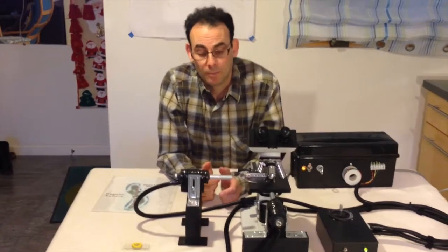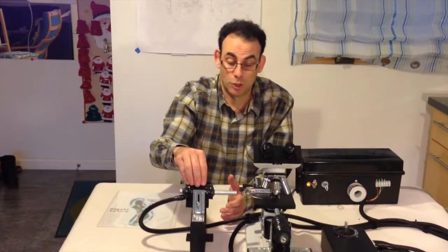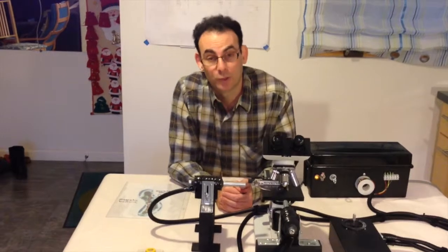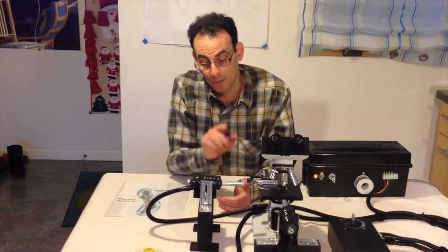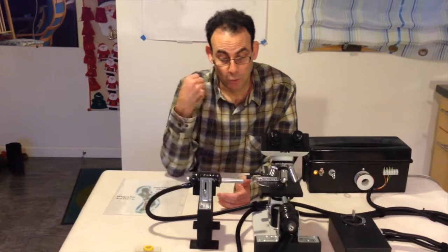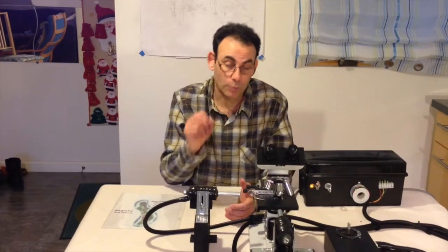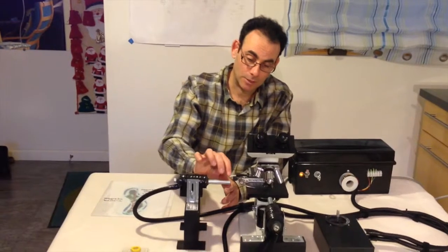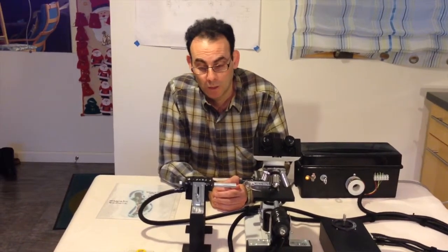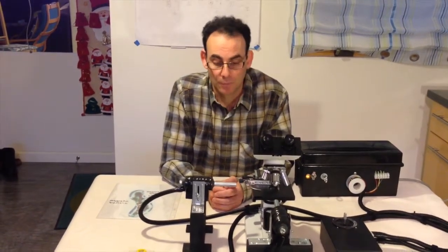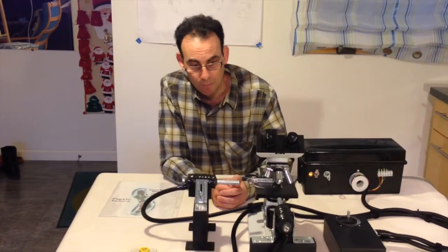The soft iron core is chosen because it amplifies the magnetic field that's produced in the solenoid here. This is wrapped in black tape, but this is just your usual copper wire electromagnet. The soft iron core amplifies that magnetic field, but it's also chosen because it has a very low residual field. Once we turn off the coil, the residual magnetization inside that core is very low compared to some other materials.